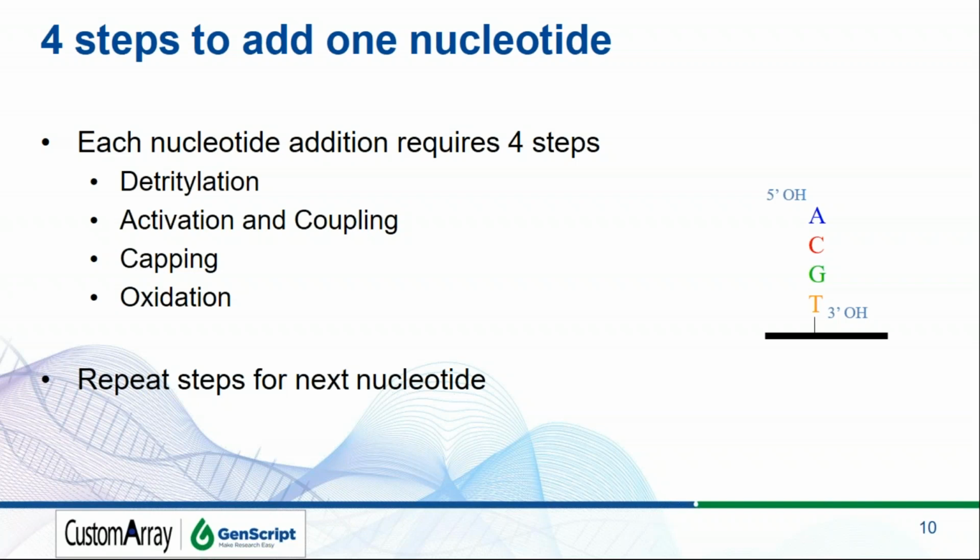All oligosynthesis, or most oligosynthesis in the world, is going to be 3' to 5', which is not as familiar to molecular biologists, where it's usually the other way. But in chemical oligosynthesis, it's 3' to 5'. There are some reverse chemistries that allow you to do it the other way, but they're relatively bespoke and not very common.